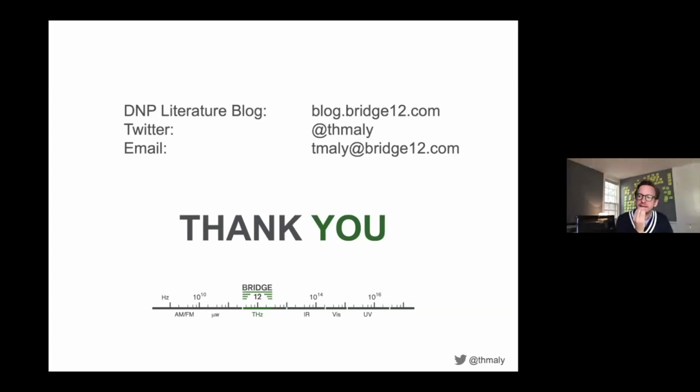Not sure if TWTs in EPR are typically used at X-band or Q-band frequencies. Your amplifier to generate the power pulses is always operating at the spectroscopy frequency where you want to do the spectroscopy. So you can have TWTs at higher frequencies. I think the highest I'm aware of right now is something like 250 gigahertz, 5 watts, something around there.